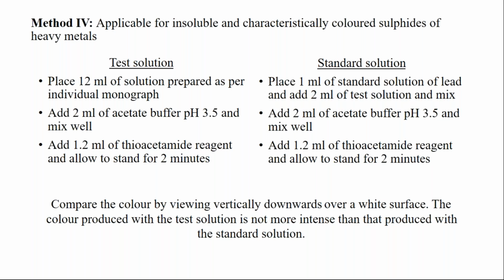You saw it didn't give a clear solution. Then you try to follow method 2 also. You are not getting the proper conclusion. Then you try to dissolve that substance in dilute NaOH solution, that is your method 3. Still you are not getting a clear solution. So finally you are left with no option because you see that your compound is insoluble in nature, you're going to follow method 4.